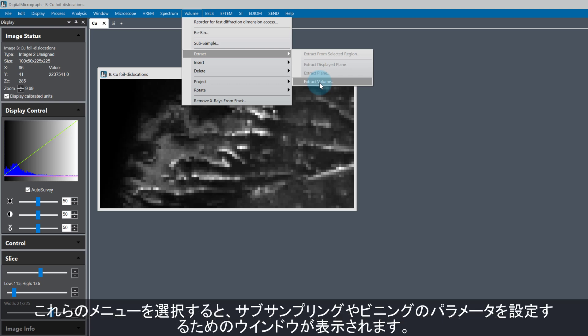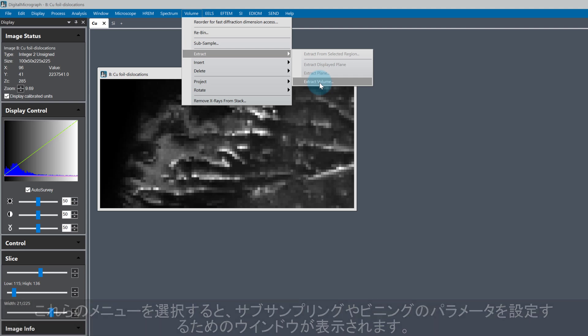Clicking on any of these causes a dialog to be displayed, where we then need to choose our sub-sampling or binning parameters for the specific routine.